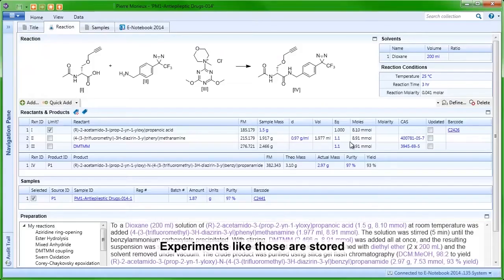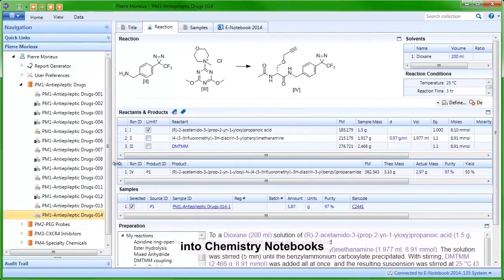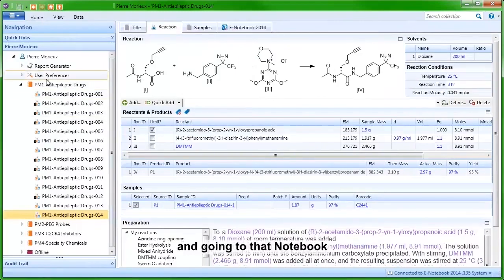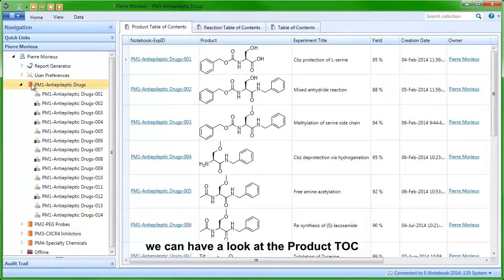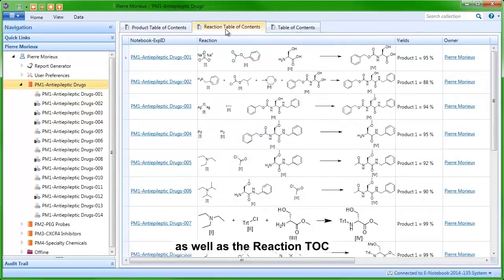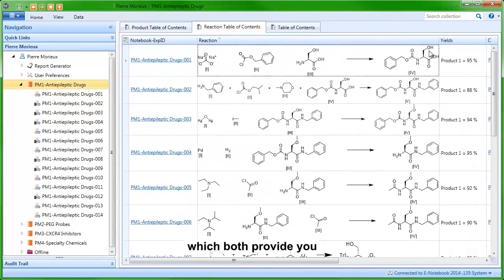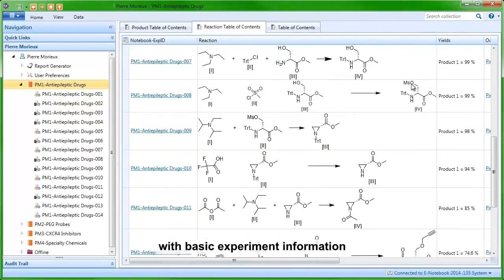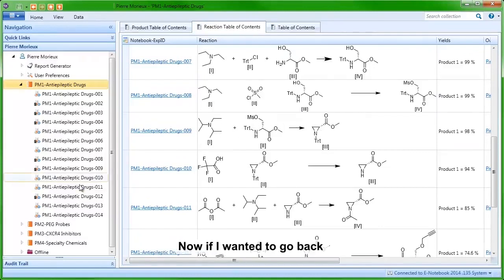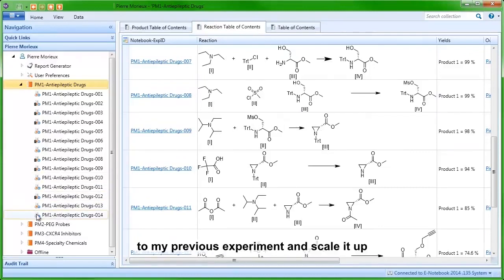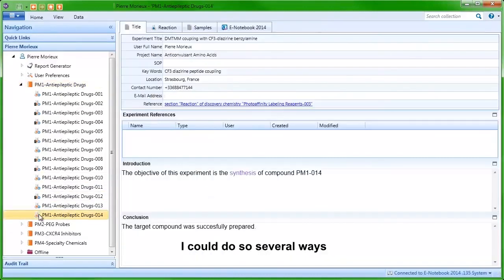Experiments like those are stored into chemistry notebooks. Going to that notebook, we can have a look at the product table of content as well as the reaction table of content, which both provide you with basic experiment information. Now, if I wanted to go back to my previous experiment and scale it up, I could do so several ways.